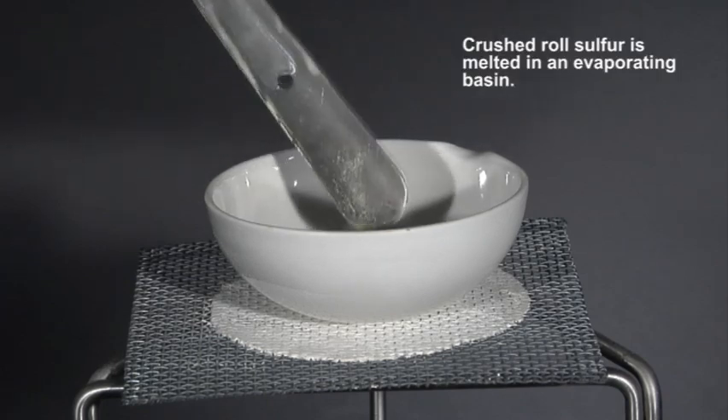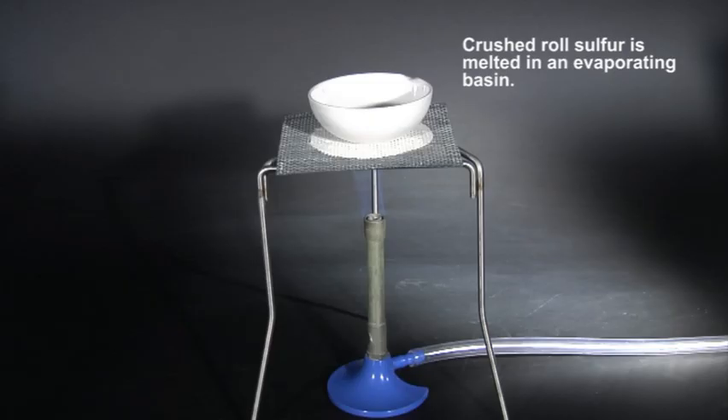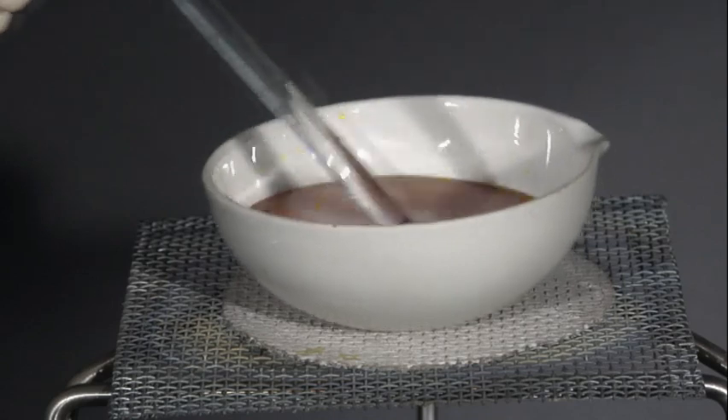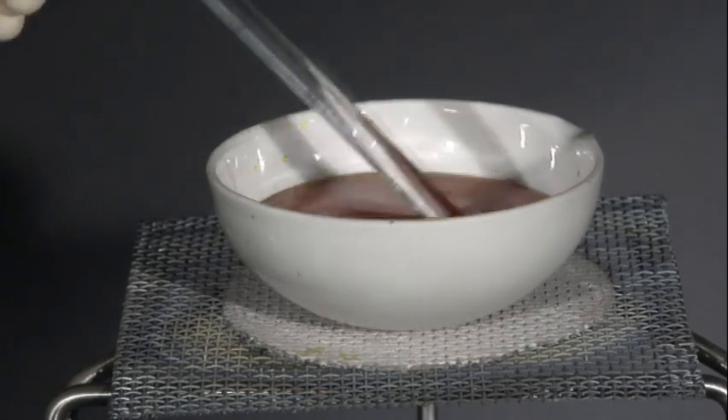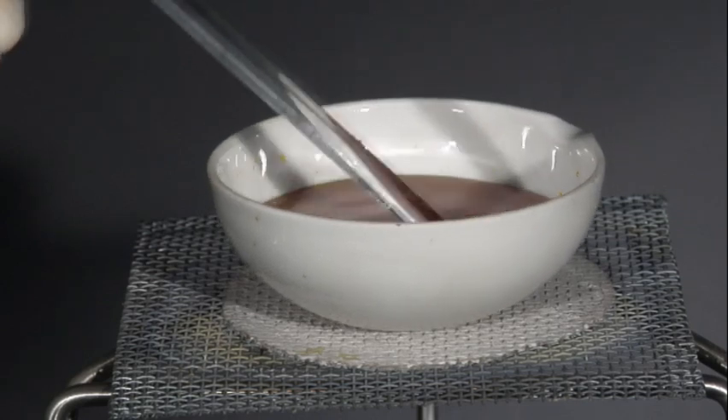Monoclinic sulphur is only stable above 95.3 degrees Celsius, and needle-shaped crystals of the element can conveniently be prepared from molten roll sulphur.